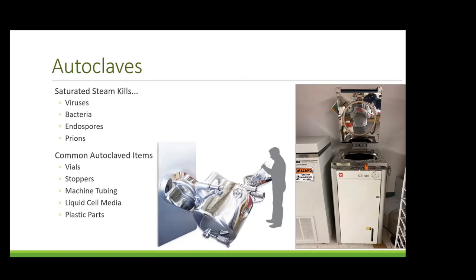Autoclaves are some of the most common types of sterilizers. This is mostly because steam is cheap, safe, and easy to produce. Steam is also able to destroy all types of microbial life because the steam denatures and coagulates proteins.